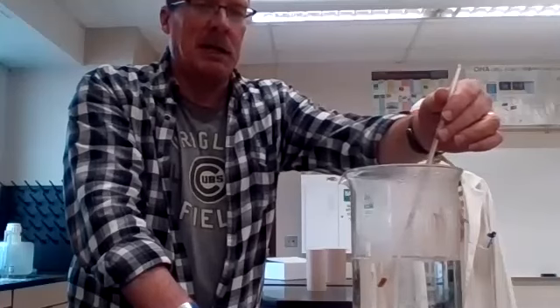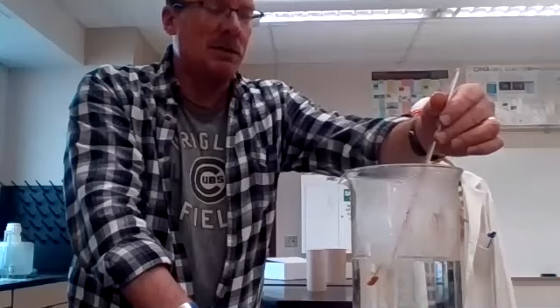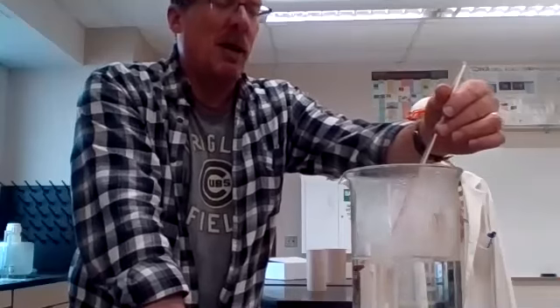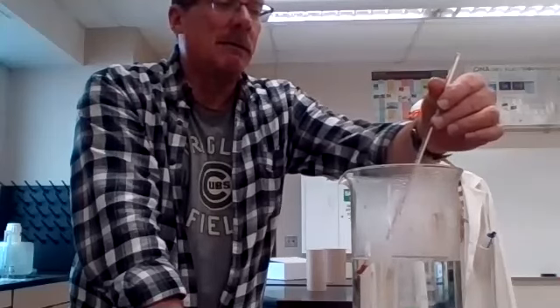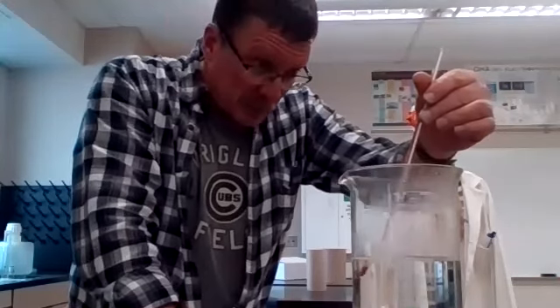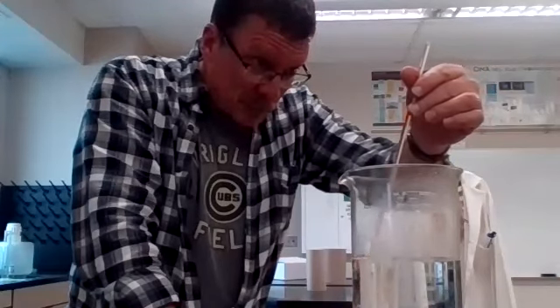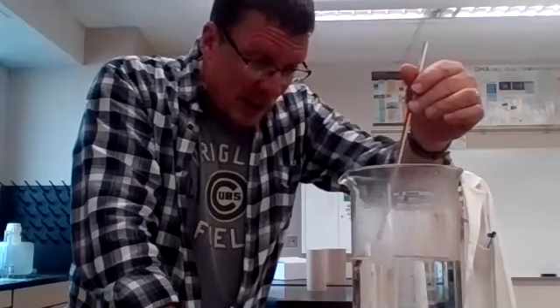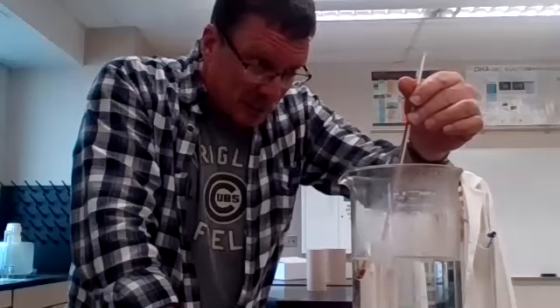And this is the exciting part of the lab. This is where the thrills come in as you sit and watch me stare at a thermometer till the temperature equilibrates. And it appears that we are happy boiling at 98 degrees Celsius.